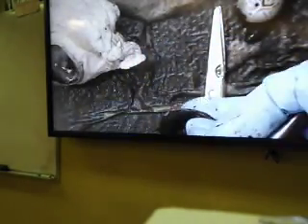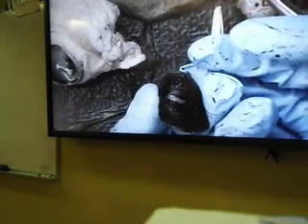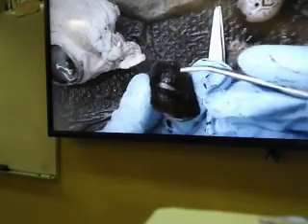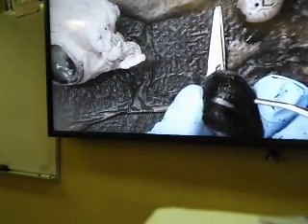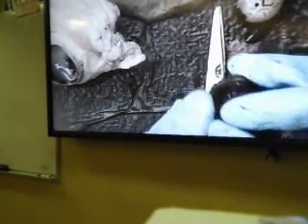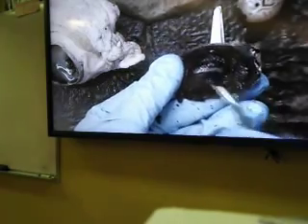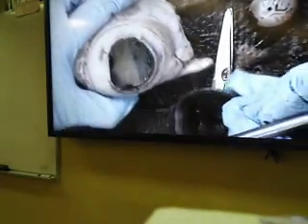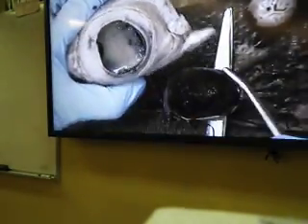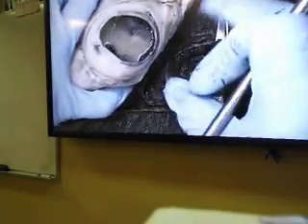Yes, there is something that's coming out. That's something that I want to mention right after that. So we already had outer layer, sclera and cornea, which was part of it. So what will iris and ciliary body be part of? Iris and ciliary body will be part of the middle layer, also called vascular tunic. Now, this middle layer or vascular tunic has only iris and ciliary body in the anterior cavity, but it has another structure which is on the posterior cavity, which we call choroid, sometimes also called choroid coat.